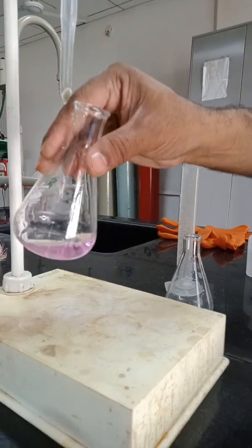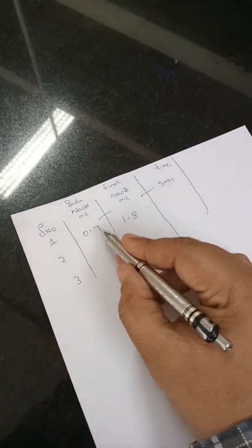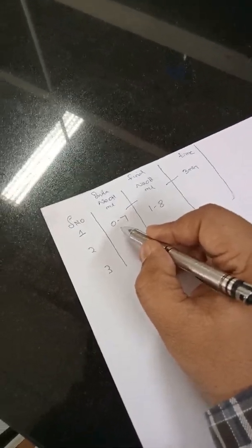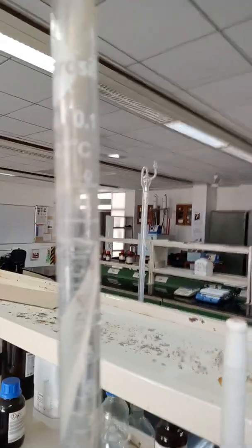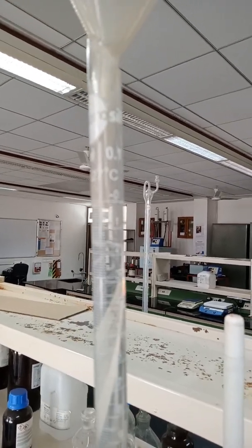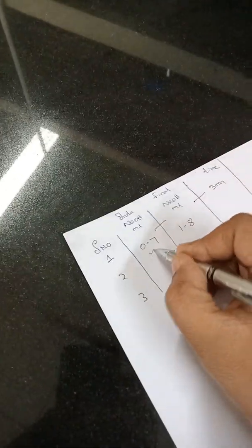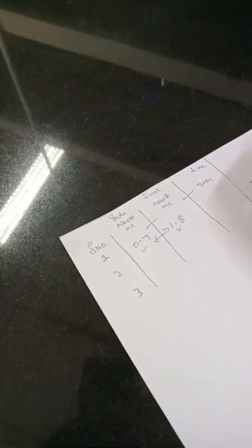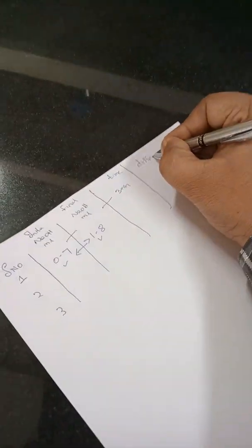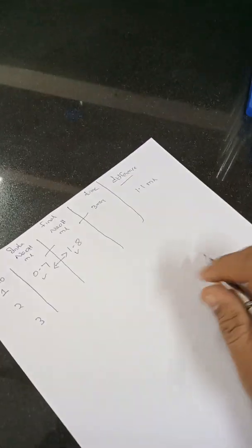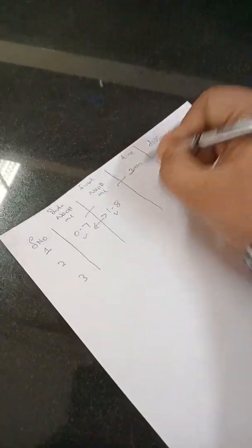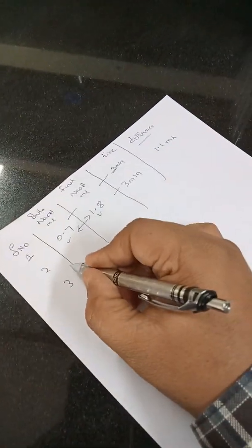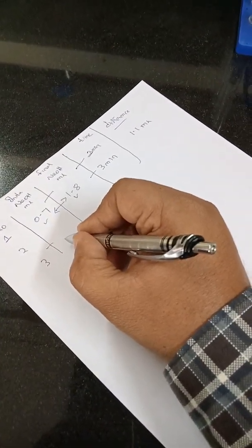Now we check how much NaOH in ml was consumed for this titration. The initial burette reading is 0.7 ml. The difference between initial and final readings gives the amount of NaOH consumed. 1.1 ml of NaOH is consumed. So this is the result after approximately 3 minutes. Let us see after some more time how much NaOH is consumed. The next titration starts at 1.8 ml.